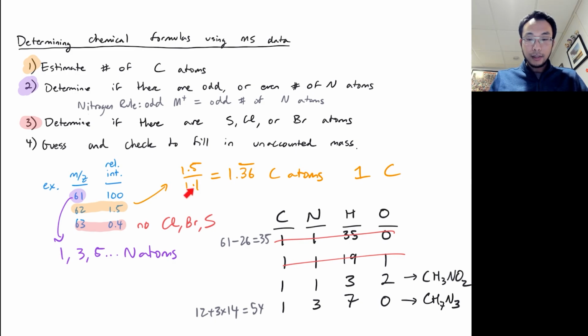And so that conveniently works out to be the missing piece here between 1.1 and 1.5, right? So I would predict, based on this data, that it makes a little more sense for me to go with the first formula because the nitrogen isotope pattern seems to do a better job of matching what was actually reported in the data. So we'll say that this is our best option.